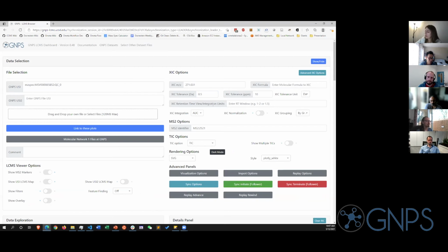Another point I want to make about the dashboard itself is that there are standalone viewers, external software that do a lot of these things and way more. I will admit, way more. Our goals here are to make a set of features that allow us to do 80% of what we want to do. Then the last 20%, if you want something very specific, I think that's the role of vendor software or other open source desktop software. That's our zone of operation.